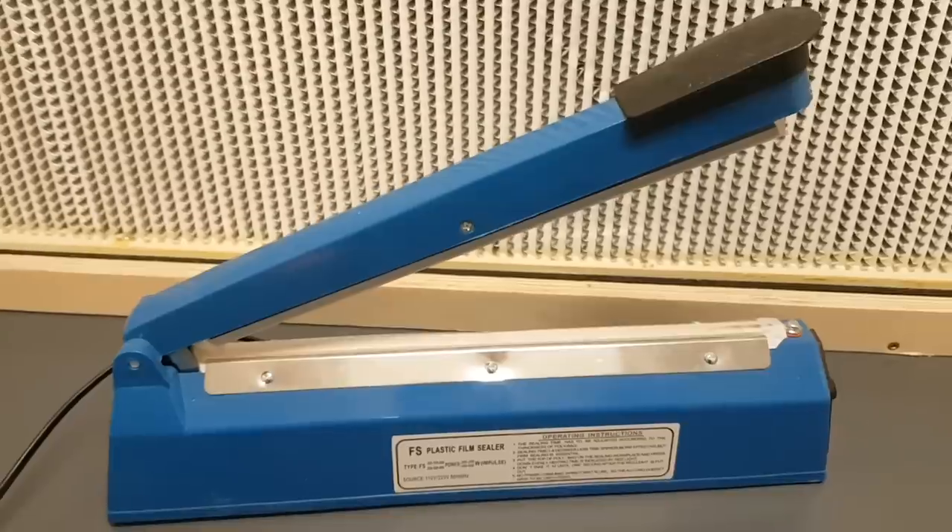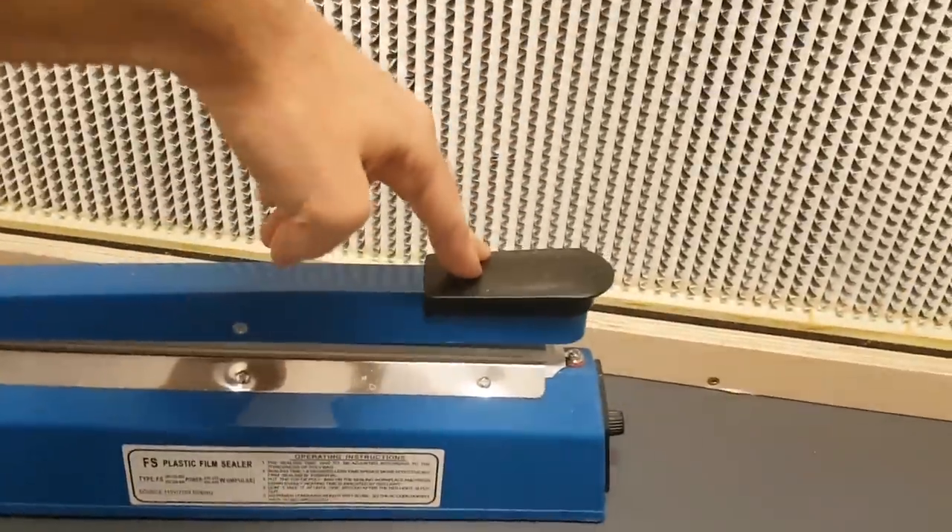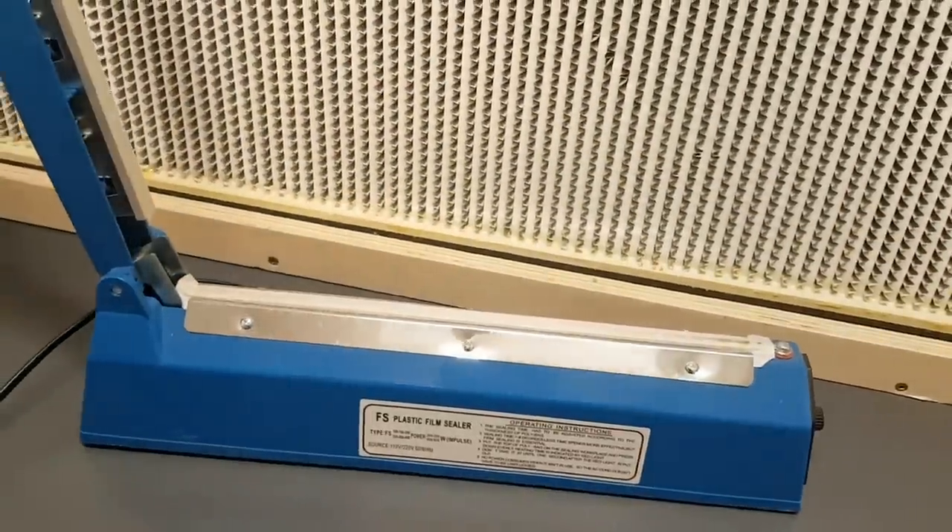Mushroom grow bags are great to have on hand. They work well for making fruiting blocks, and there are different ways to seal the top of these bags, which affects what you need in your lab. To seal them after inoculation, I like to use an impulse sealer — it closes off the top while leaving room to mix your fruiting block and disperse grain spawn throughout the substrate. If you don't have one, you can fold the top and secure it with a wire or a zip tie, which is a lot quicker.